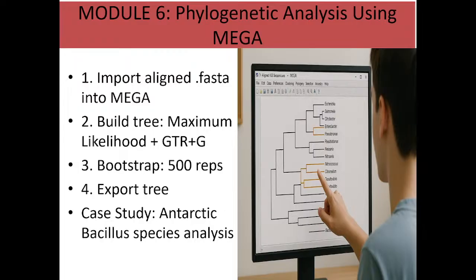In fact, you can even prompt ChatGPT that you don't know anything at all, you are a novice. You don't know anything about microbiology, you are just a beginner. Please interpret this result for me. And that is the extent we have gotten to when we are talking of advancements now.